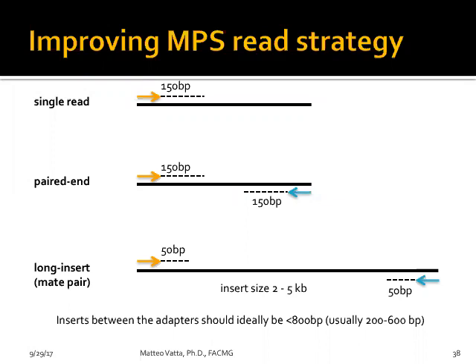But it was seen very early on that there are events, for instance translocation and fusion protein, fusion gene events, where you could have one sequence from one side which matches one particular gene, and the sequence from the other side of the fragment you were sequencing was coming from another part of the genome, and so people got confused.